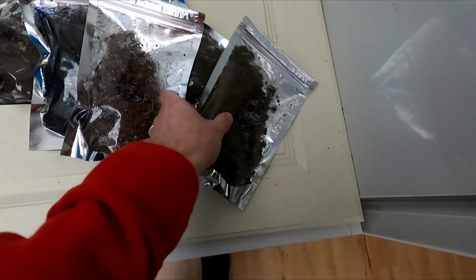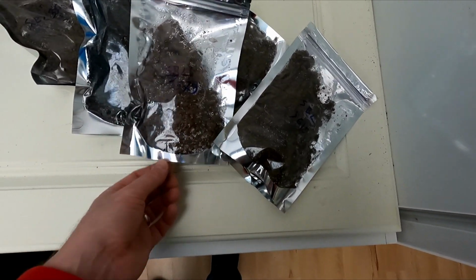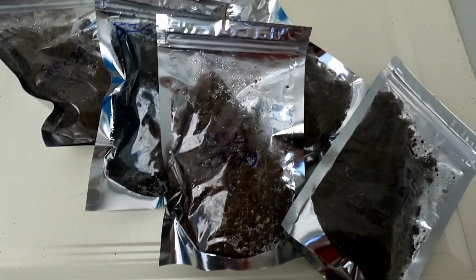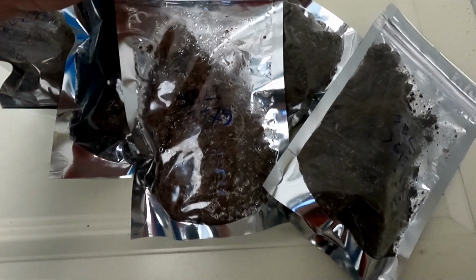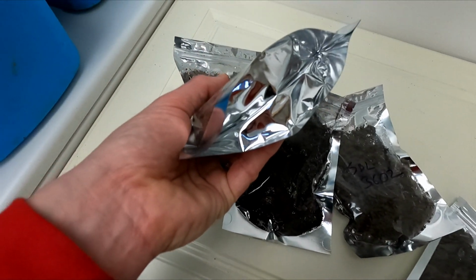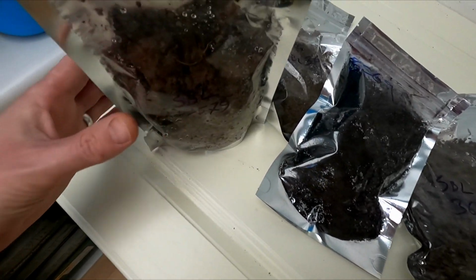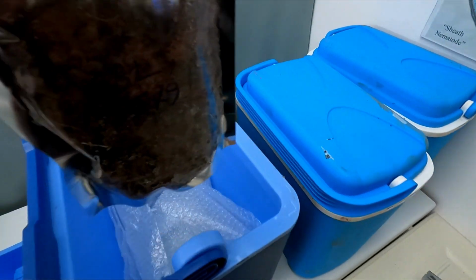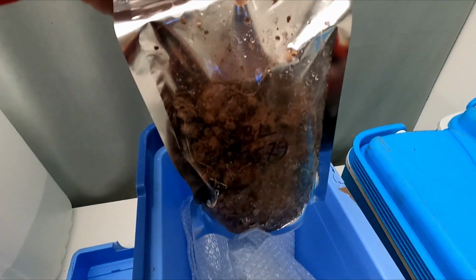Last but not least, we are now going to put my bags of soil in. These are the ones that I've collected out in the field, and obviously they'll get added in as I go. These are quite cool bags because they have a flat bottom, which means that the bags themselves can stand up. That makes it quite easy to put into my cool chamber.